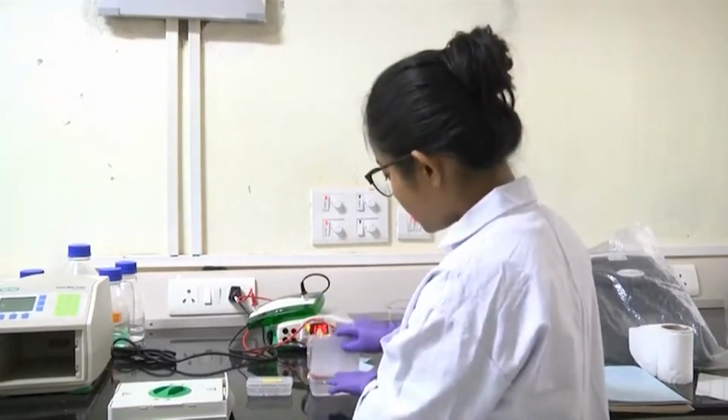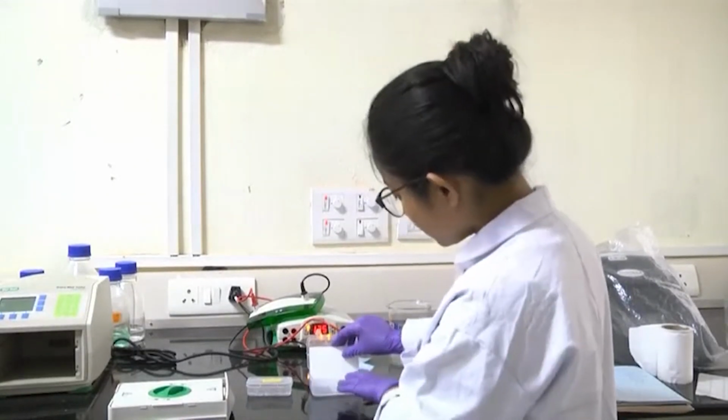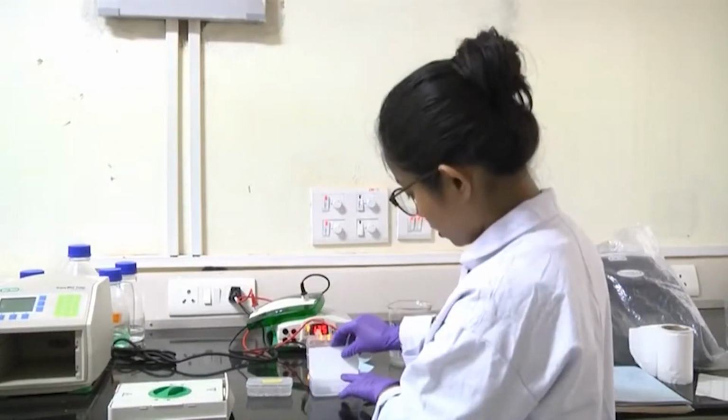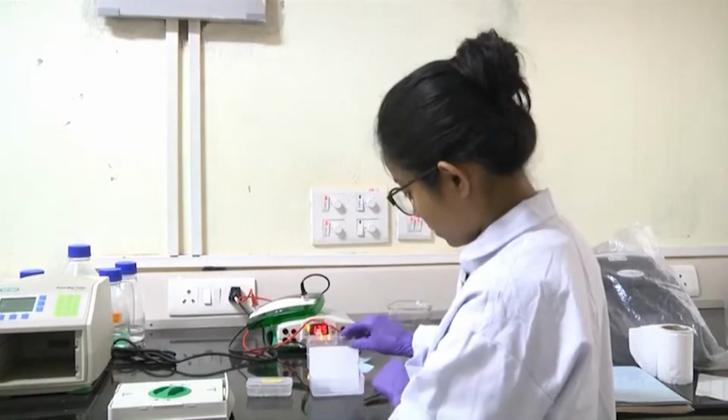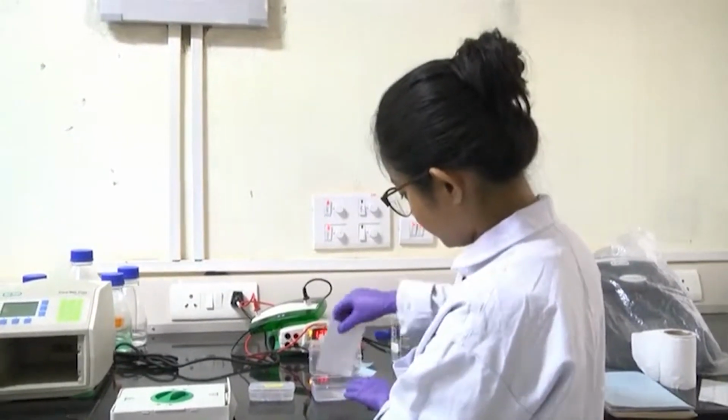After this we will go for the transfer. We will make a sandwich. So just keep the blotting paper here in the transfer buffer. Due to capillary action it will get soaked in the transfer buffer.